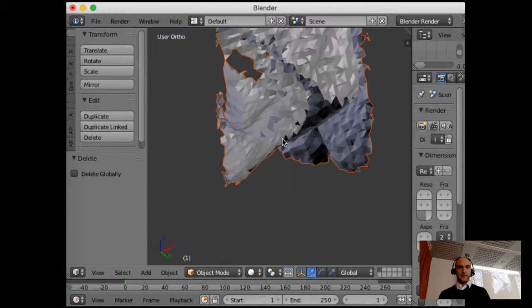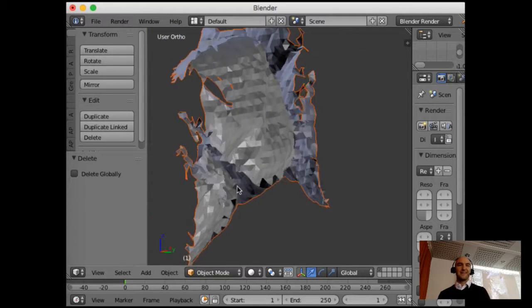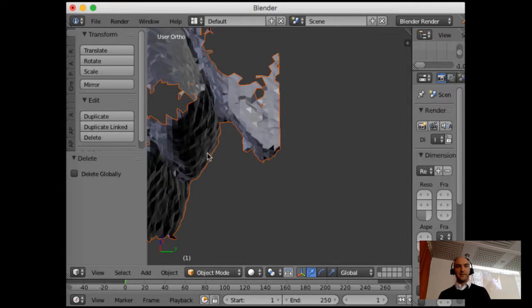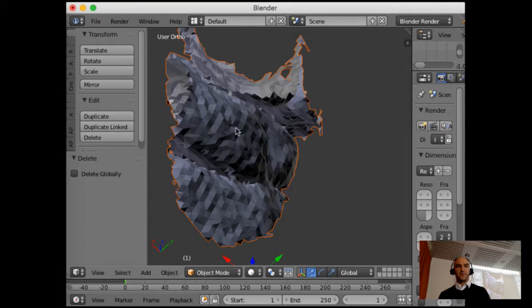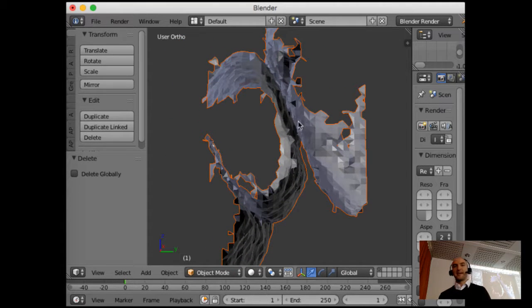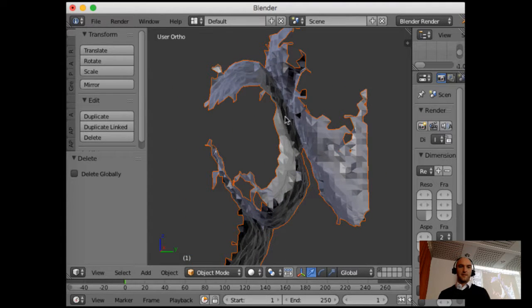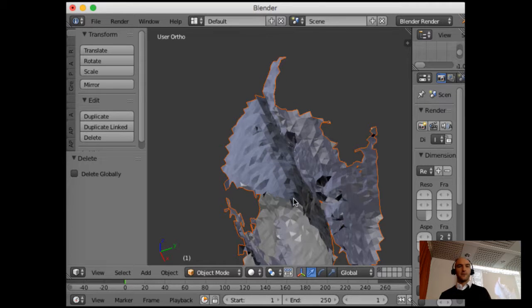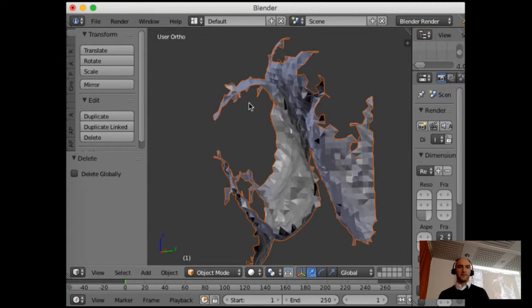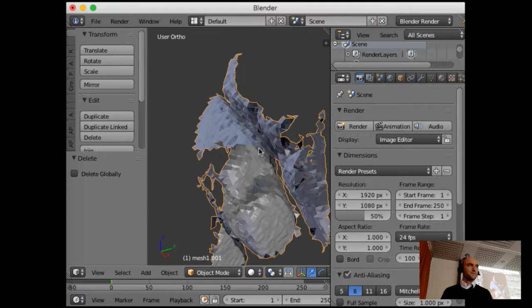And here in these precipitates, it's not as representative, but we might want to have a proximity histogram from this part, and if there wasn't the second precipitate, we might want to have a proximity histogram just here, or we might want to have one along the corner and one along the face of the precipitate. And to do that, we're going to use something called Vertex Groups.